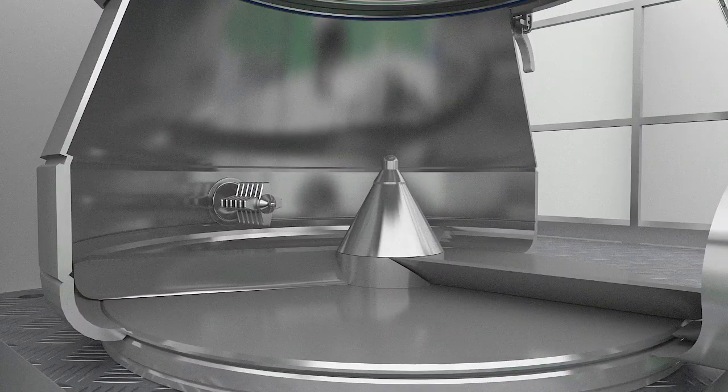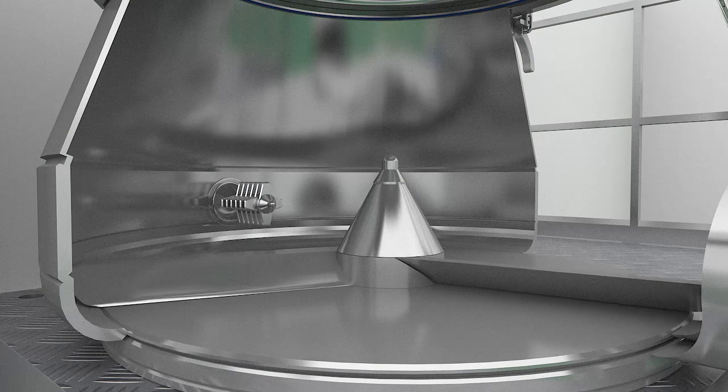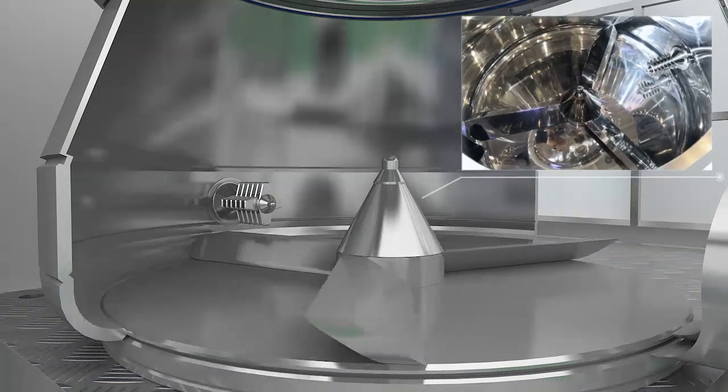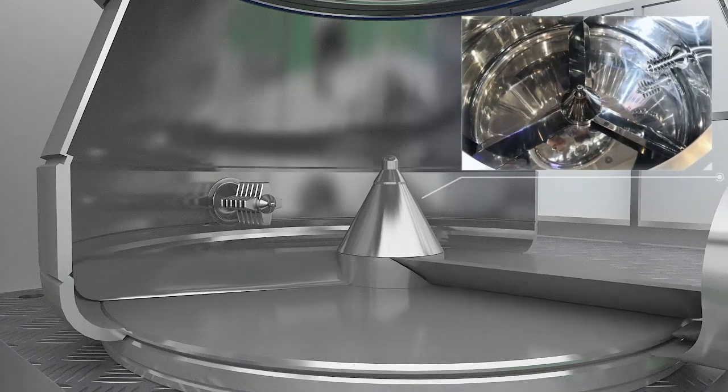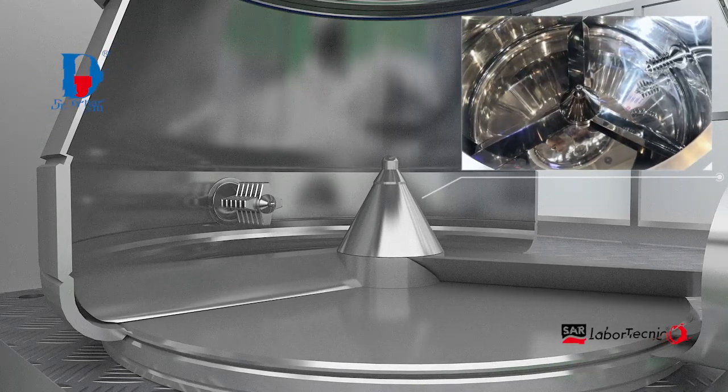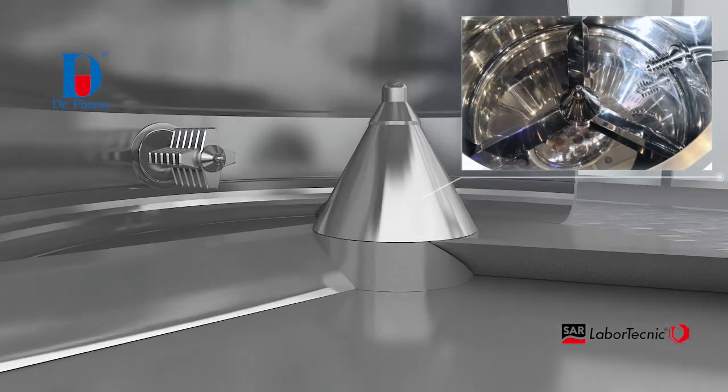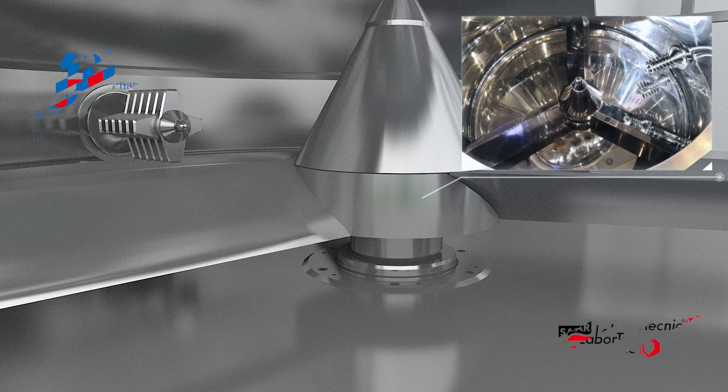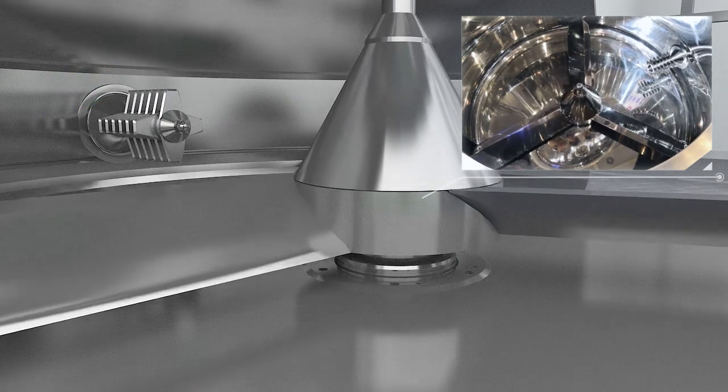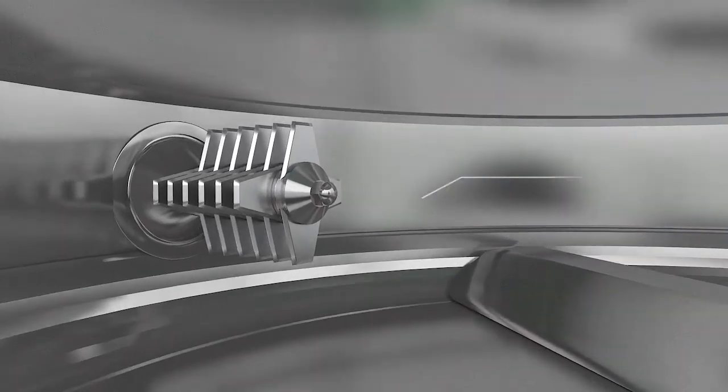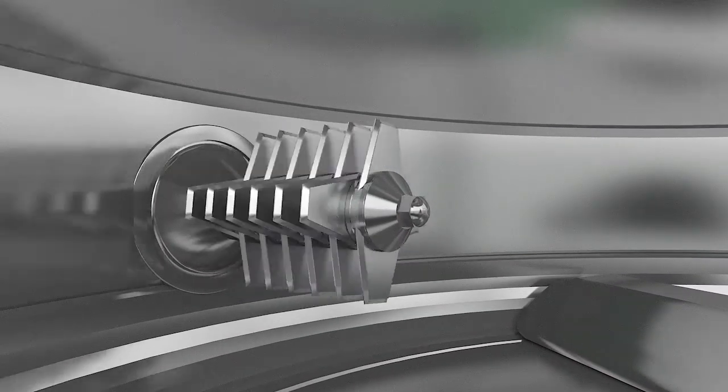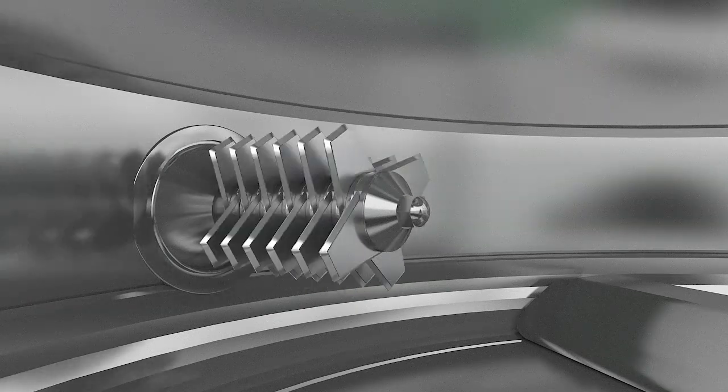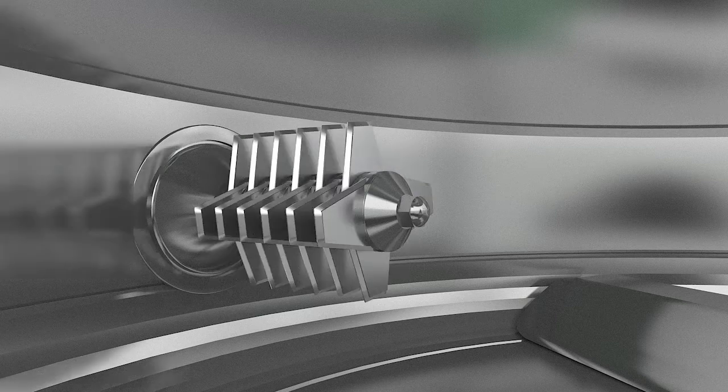The pot body rounding R60 is more favorable for material fluidity and the granulation effect is good. Stirring paddle equipped with a special heavy-duty motor with soft starts and frequency controls suitable for different materials. The panel can be lifted automatically for inspection after cleaning. The chopper has variable frequency control up to 3,000 revolutions per minute. The main shaft and chopper shaft are designed with a one-way flow valve.